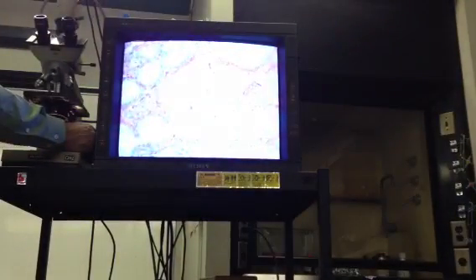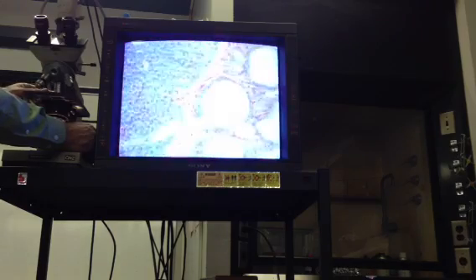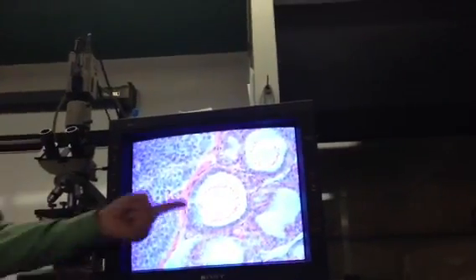But anyway, one thing that sometimes I do have a tendency to get a little tricky with this because you'll see that there are thyroid follicles roughly the same size, and a lot of times you'll see a small artery or a vein. And sometimes I'll ask you to identify the gland. You say, oh, I know that.